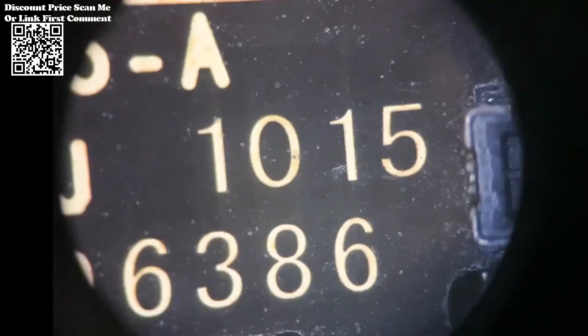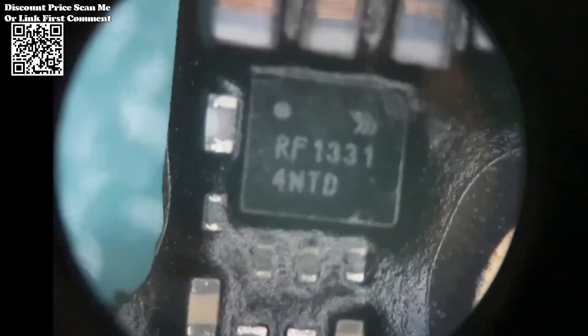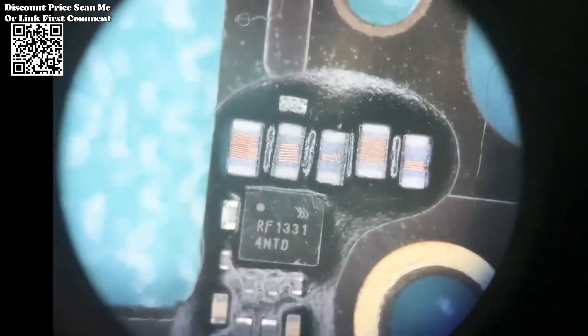Continuous Zoom Optical System: Experience unparalleled flexibility and precision with the 7-50x Continuous Zoom feature. Whether you're examining intricate circuitry or conducting detailed soldering work, this microscope offers precise magnification adjustments to suit your needs.